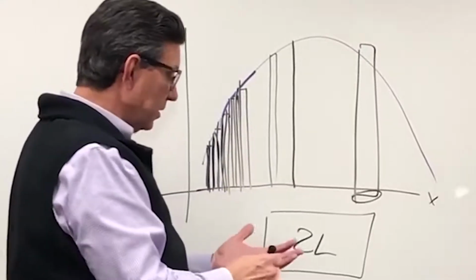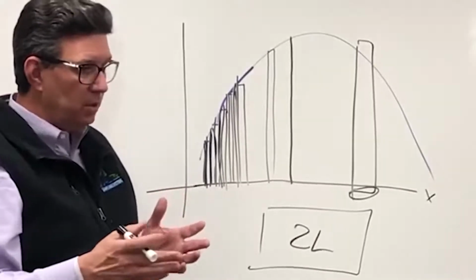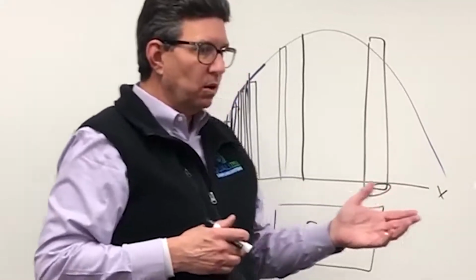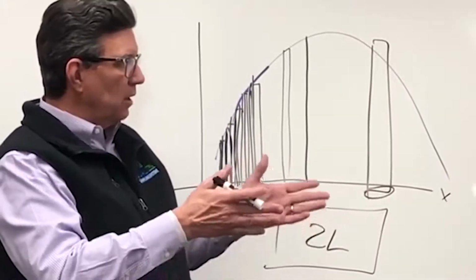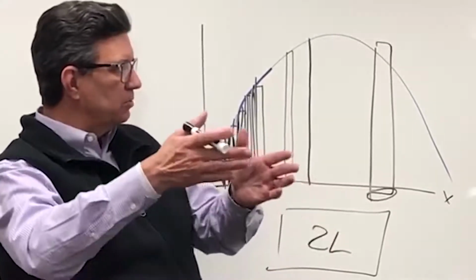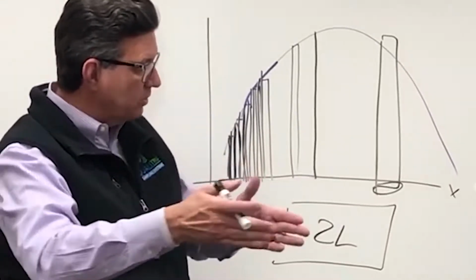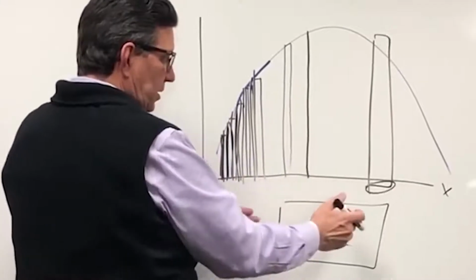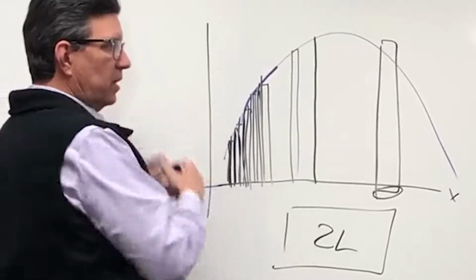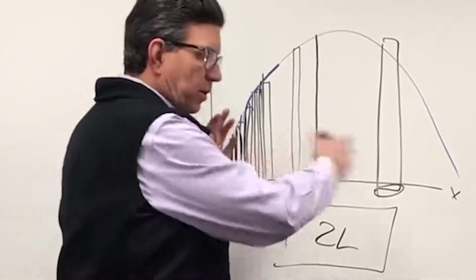And this could be a sample that you're taking off from a process line in a plant. It could be you're unloading a silo into a tanker truck. It could be that you're milking a pen of cows, maybe 60 to 100 cows in a pen, and milking those pen of cows into a large bulk tank or a large silo, and you want to understand what's going on with each pen of cows. Now I can run the same process and get a 2-liter bag of sample that's very representative of the original product, the 60 cows, the process line.